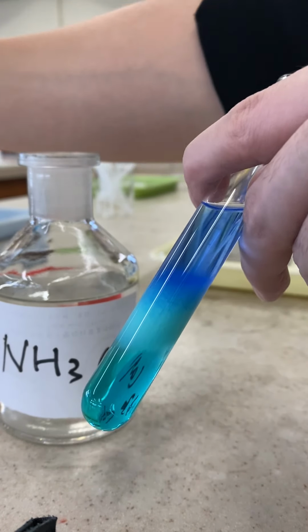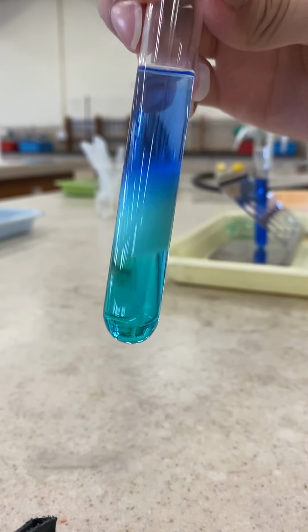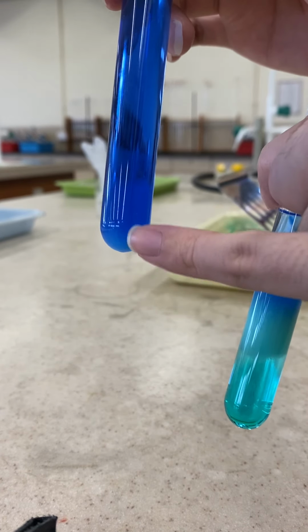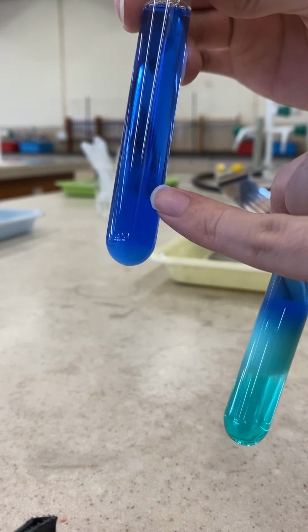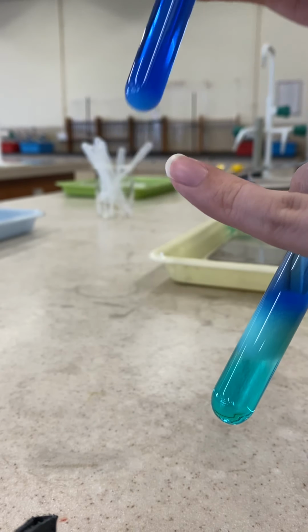Maybe I stop here. What you can observe is again the deep blue solution. You see that? It is actually the same result as the first part of the experiment. Originally a blue solution, then the formation of some precipitate or pale blue solid, and after you add enough ammonia, it turns into a deep blue solution.